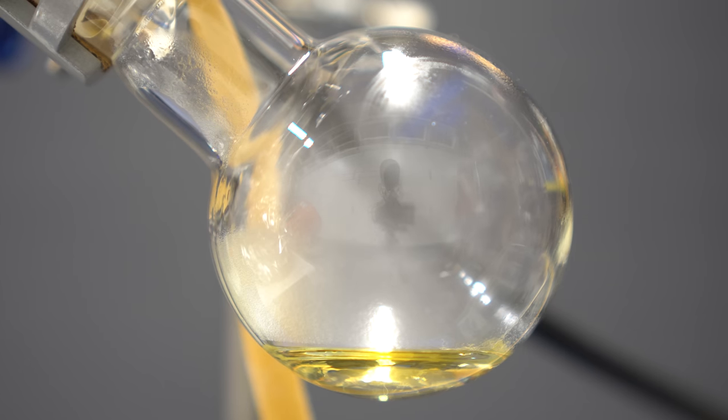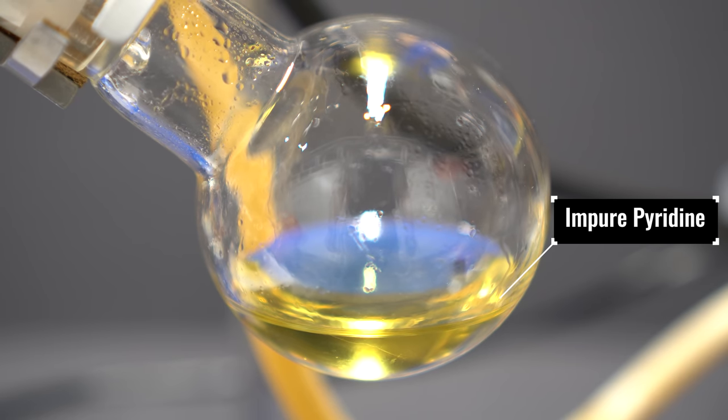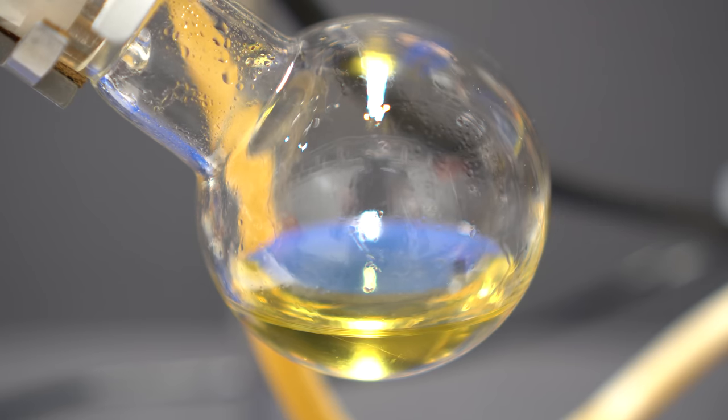The pyridine that comes over is not pure in any way, and there's an impurity that makes the solution look yellow. I say solution, as there's likely some water in there, and some impurities. When no more pyridine was coming over, I knew that I was done, and I could essentially go on to the next step.